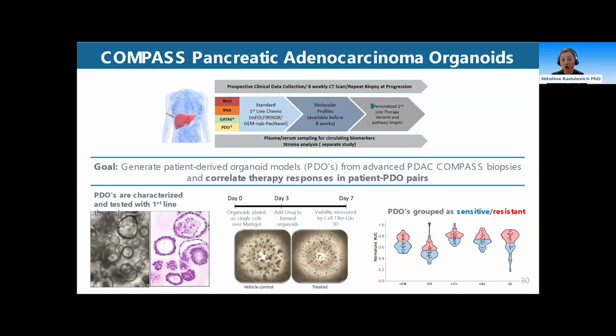Again, it depends on your initial experimental setup. Then, once you group your PDOs, you can correlate the response. If the patient is, for example, sensitive to gemcitabine, organoids should really fall within this category. That's because we still don't know how well these things correlate.